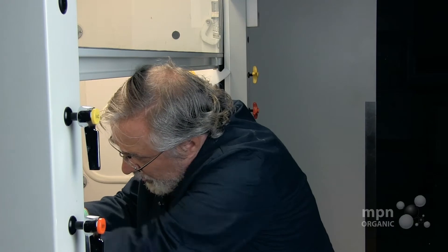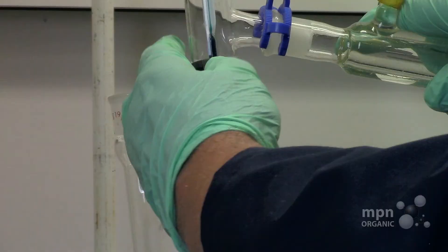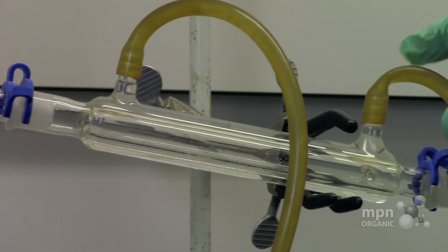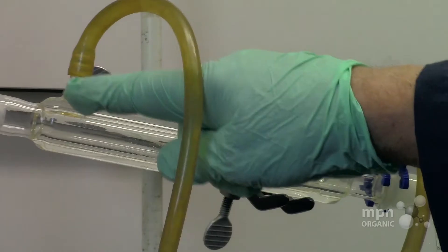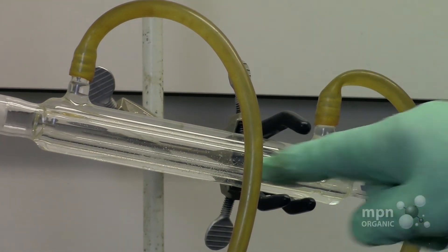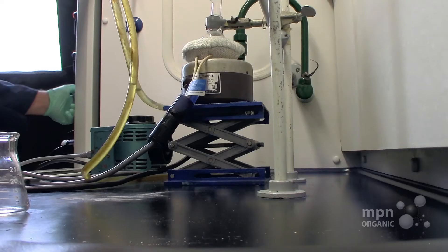If you're concerned that this is going to separate during the distillation, then you can put another Keck clamp on it. The water is going to then come in at the top lower entry point, and then come out here. If you don't do that, then you may create a vacant space in here, and you will not get efficient cooling.